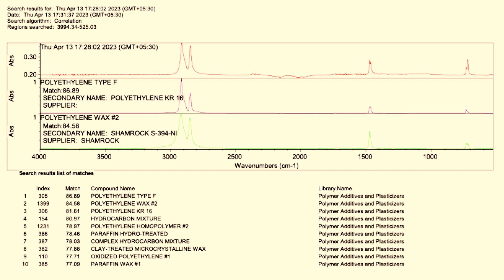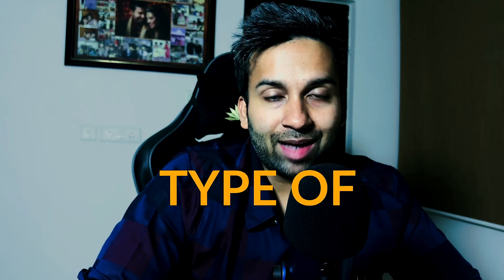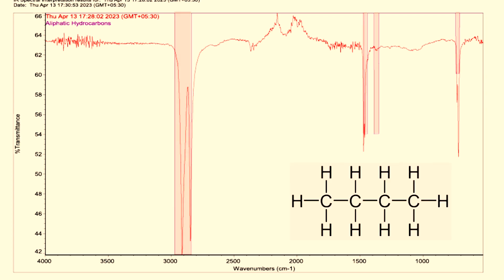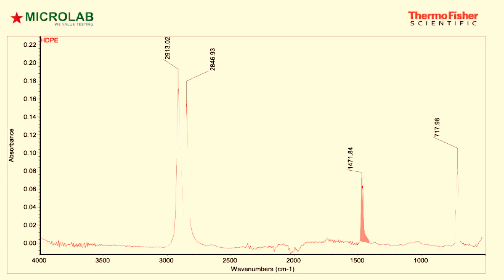Our sample shows an 86.89% match with the polyethylene sample in our database. The software can also provide the type of functional groups present in the sample, which would be useful for a polymer chemist. Here we see the sample is primarily made of aliphatic hydrocarbons — open-chained carbon-hydrogen bonds. The characteristic peaks for polyethylene are broadly in the range of 2800 to 2950 per centimeter; specifically, peaks appear at 2915 and 2847 per centimeter, with strong absorption also near 1470 per centimeter.